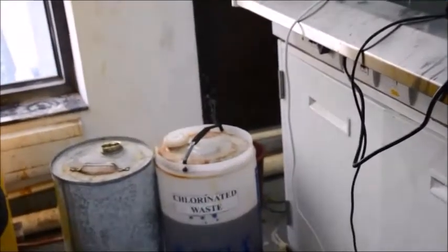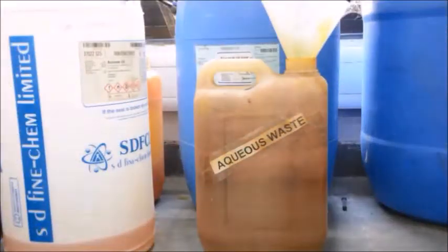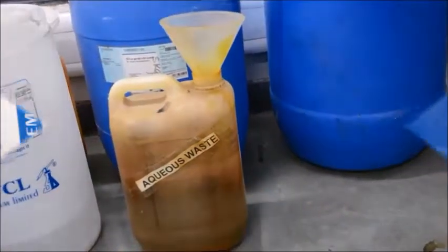The chemistry laboratory produces chlorinated solvents, non-chlorinated solvents, aqueous solvents, and solid waste, where the solid waste includes gloves, glass, and paper waste.